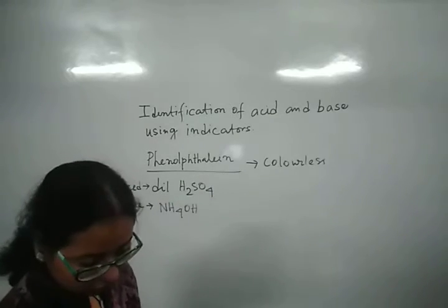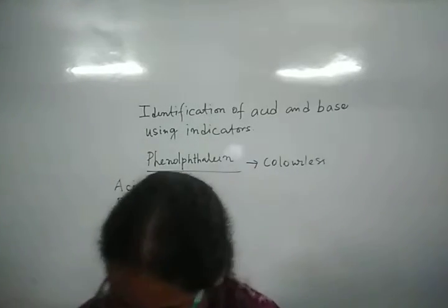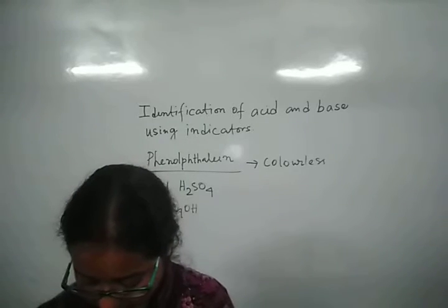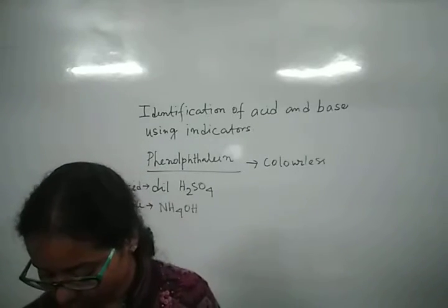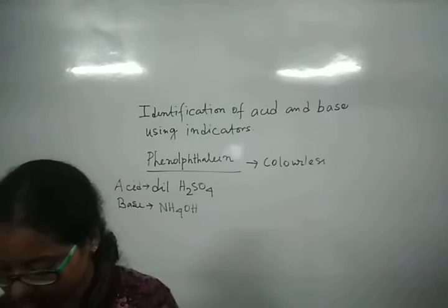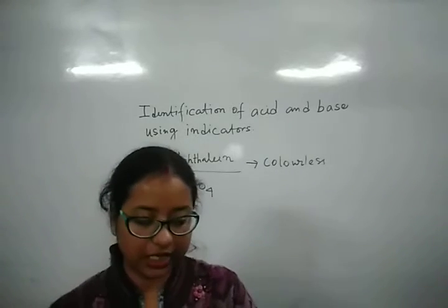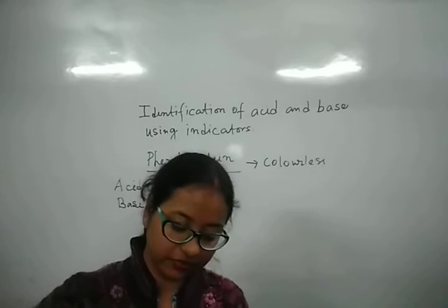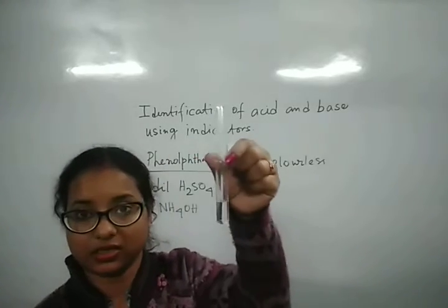Now what we are going to do: in a test tube I am going to take a small part of this acid solution.